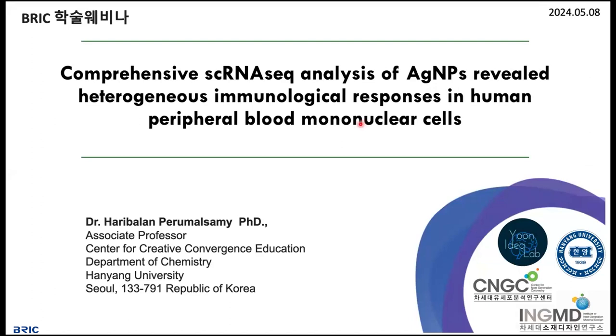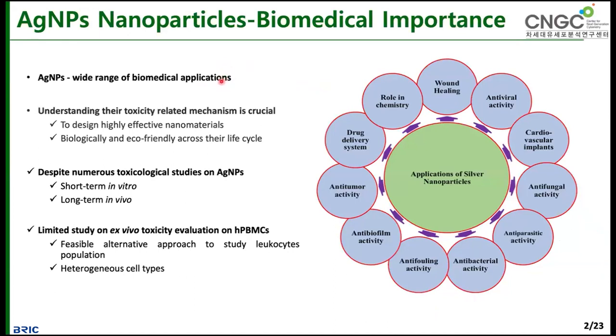So in this webinar, I'm going to explain in more detail how single cell RNA sequencing analysis is performed for many different types of biomaterials, drugs, or patient samples. Okay, so let me go one by one. Before that, in our lab we mainly focus on different types of nanomaterials like silver nanomaterial, gold nanomaterial, TiO2, and many others. We want to improve the medical application of these nanomaterials. For example, when making operation instruments or tools, we usually use some silver metal or gold. For biomedical application, you need to check how the cells are responding.